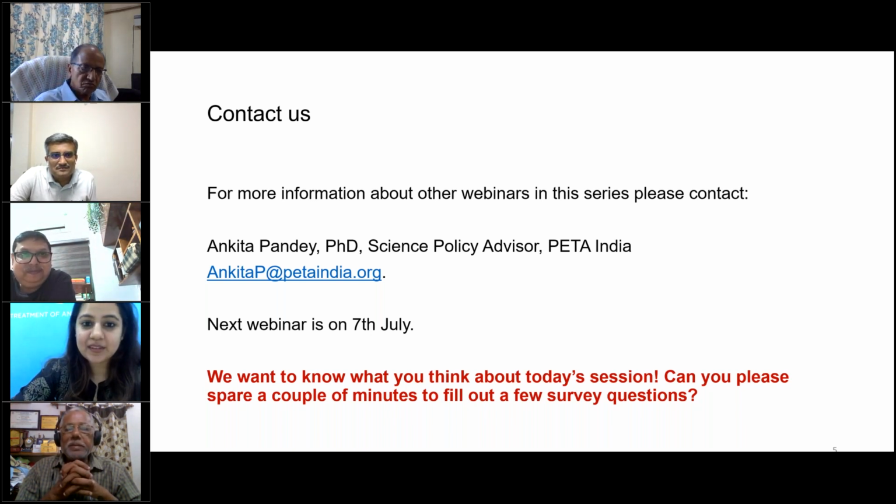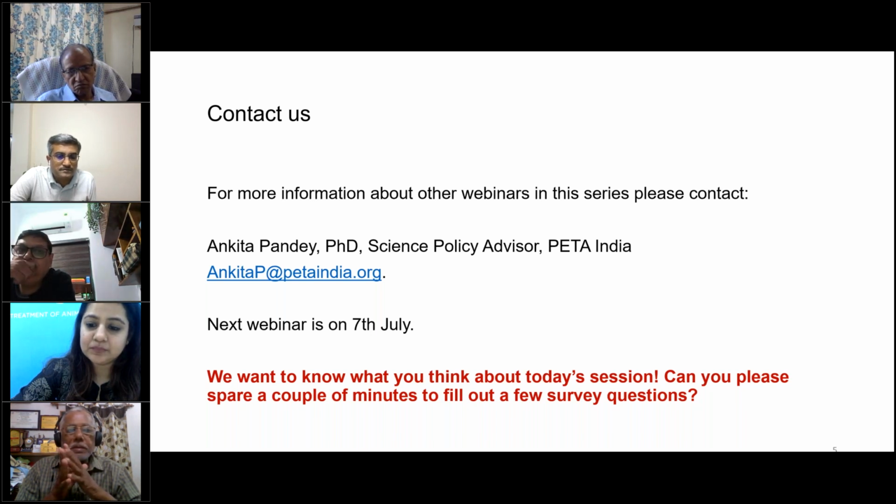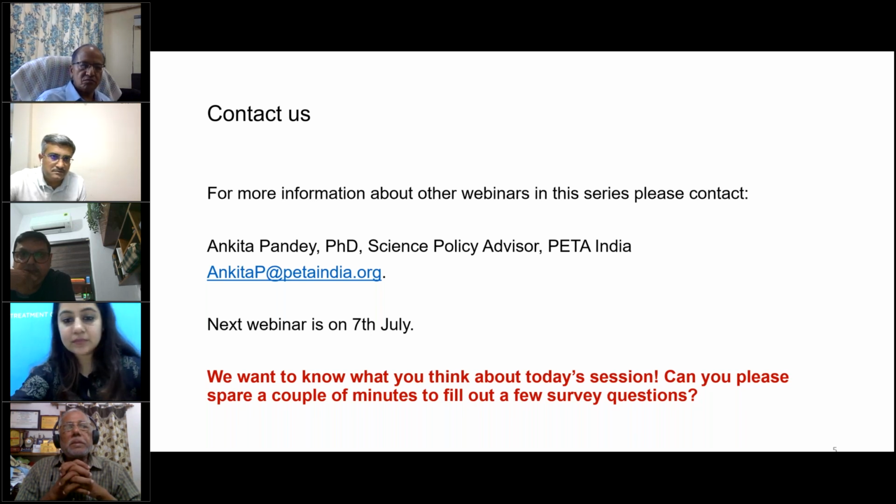All right. I don't have an answer, but it may not be one-on-one, but a combination of in vitro effects is probably a reality soon. Okay. Yes, to add upon Dr. Saini, it is the sensitivity and specificity of the assay which accounts for the consideration of a single test for this classification of chemicals. It is well articulated in the monograph, which I will share with Ankita, and she must be having that as well. So it is mandated that an additional test is required, to my understanding. Correct me if I'm wrong, Dr. Pradeep.